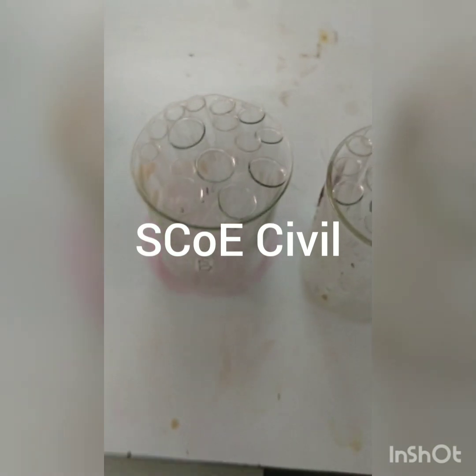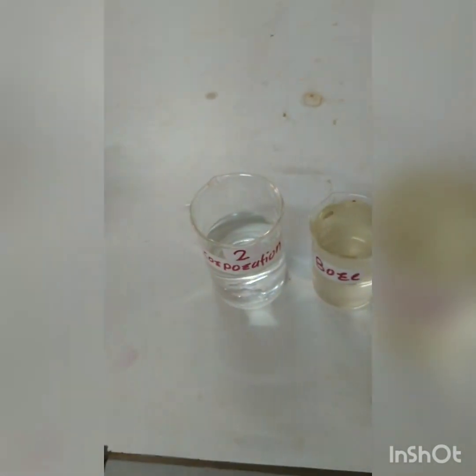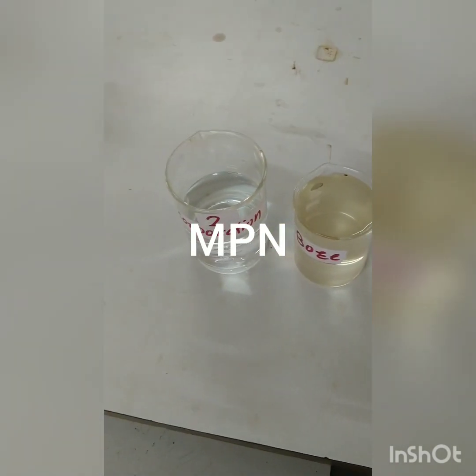This is a set of 15 tubes. The bigger ones are called double strength, the smaller ones single strength. This is set 1 and set 2. For the two samples that we are going to test — first is the corporation water and second is the bore water — we will start with the experimentation now.